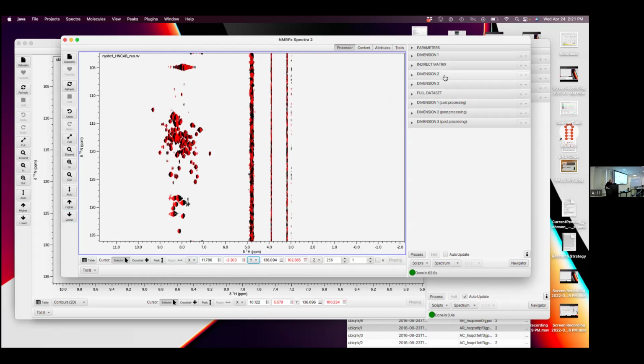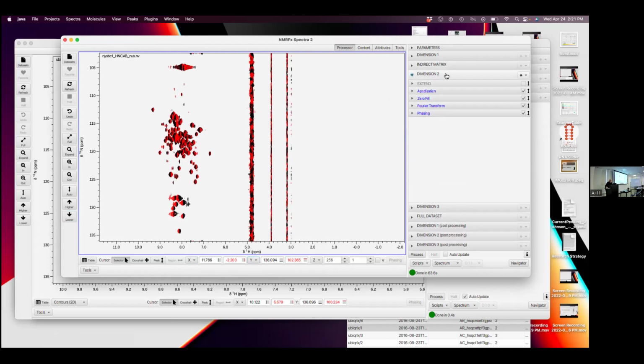So what do you do to turn around a spectrum? Two ways to do that. Generally, I get this right. If I look at the Bruker parameter files, I get it right, so it's the right orientation. But again, you can write your pulse sequence in any way you want, so the parameters don't matter.